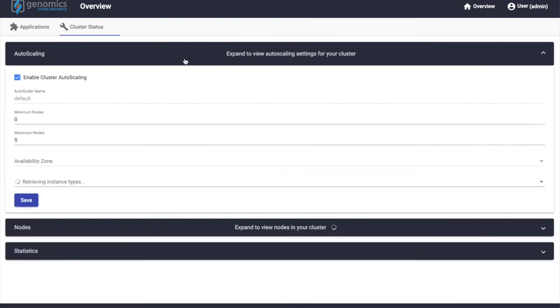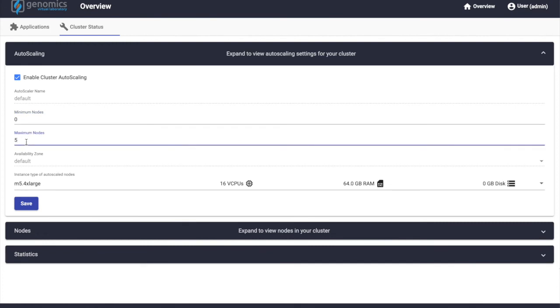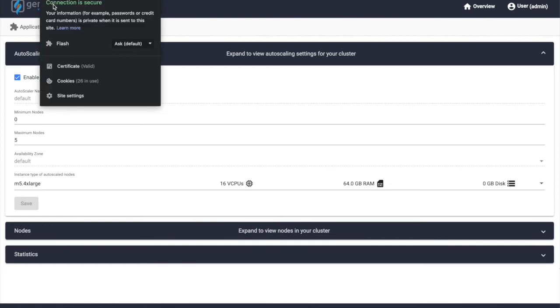Alternatively, we can enable auto scaling, which will automatically scale the size of the cluster between the minimum and the maximum values set based on the current load of the system, also allowing us to choose the virtual hardware type. Each GVL also comes with the option of having a DNS associated with it and with a signed SSL certificate.